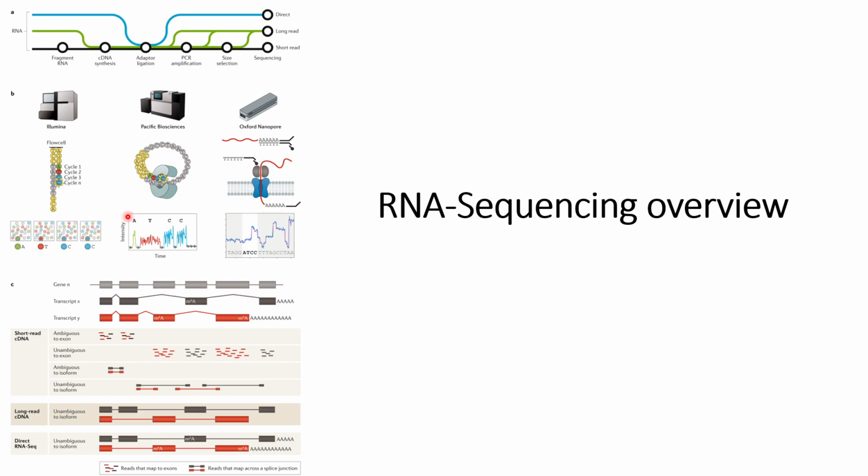In this case, instead of binding the RNA directly onto the flow cell, it makes round shaped molecules, which later pass through the instrument, where the fluorescent labeled nucleotides are identified. In the example shown here, green is represented by A, T by red, and C by blue.